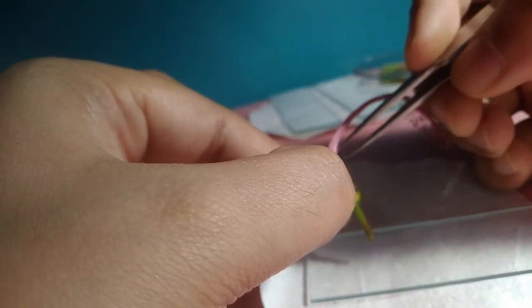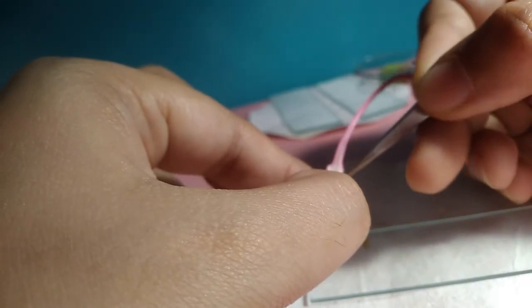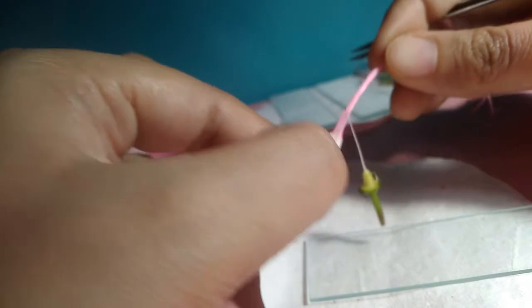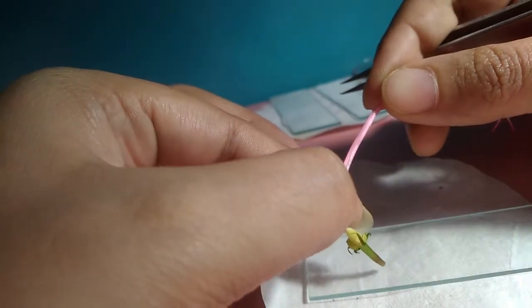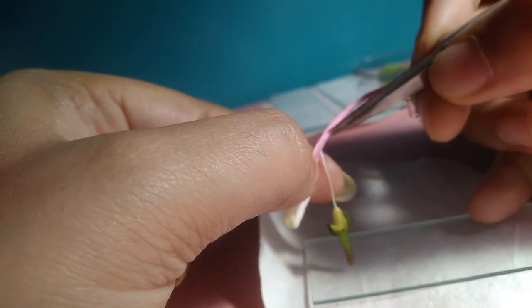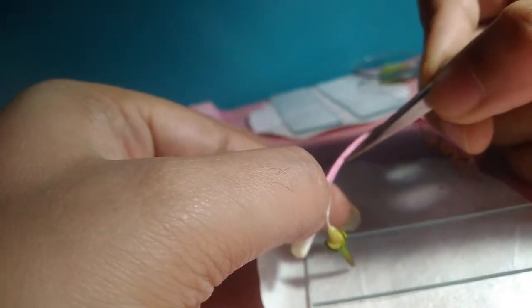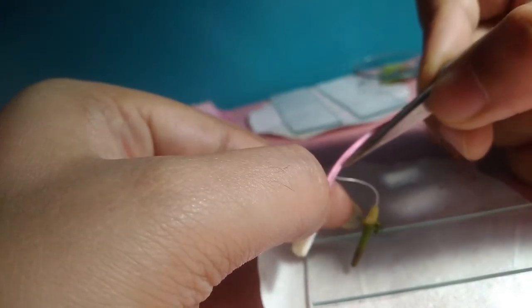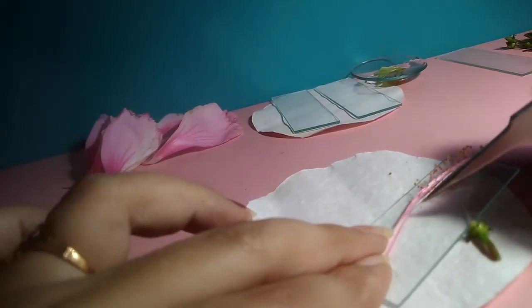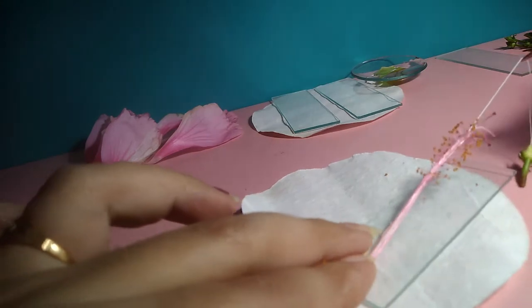Sorry, style. We will remove our style from this monadelphous staminal column. You can see that the style is coming out. You can see how thin the style is, and it can break anytime if you are not extremely careful. Yes.